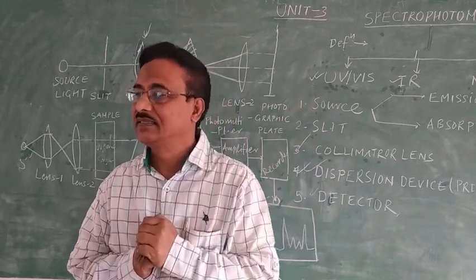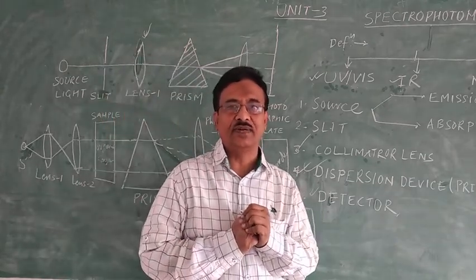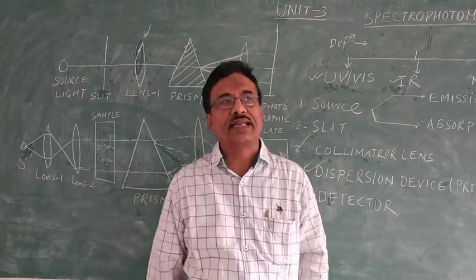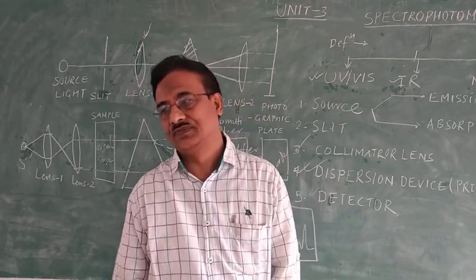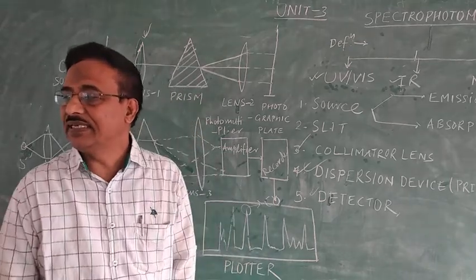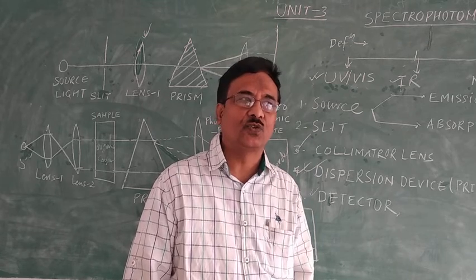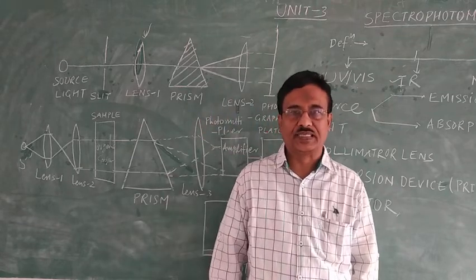Third is drug identification, how you will detect drugs which are unknown. And fourth application is nucleic acid purity. Purity is detected through UV-visible and IR spectrophotometer.